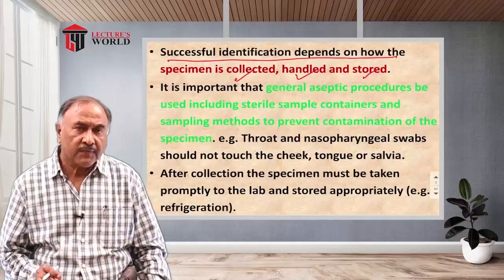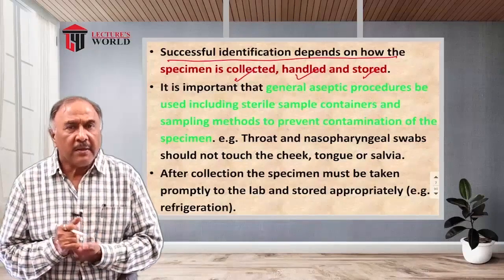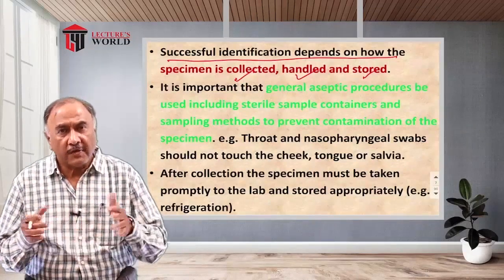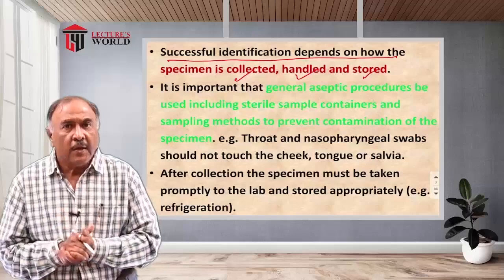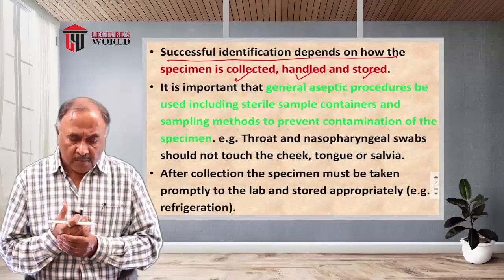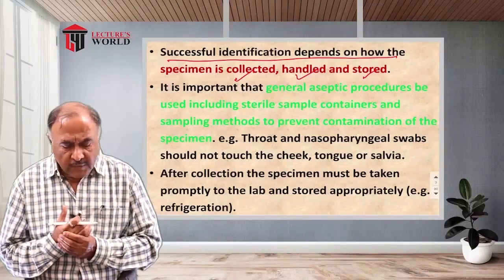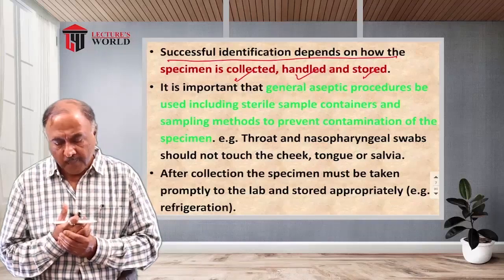In many cases, acid-fast staining is used, and there are two variations. One uses normal heat procedures, and the other is the cold method, which is known as the Kinyoun method.